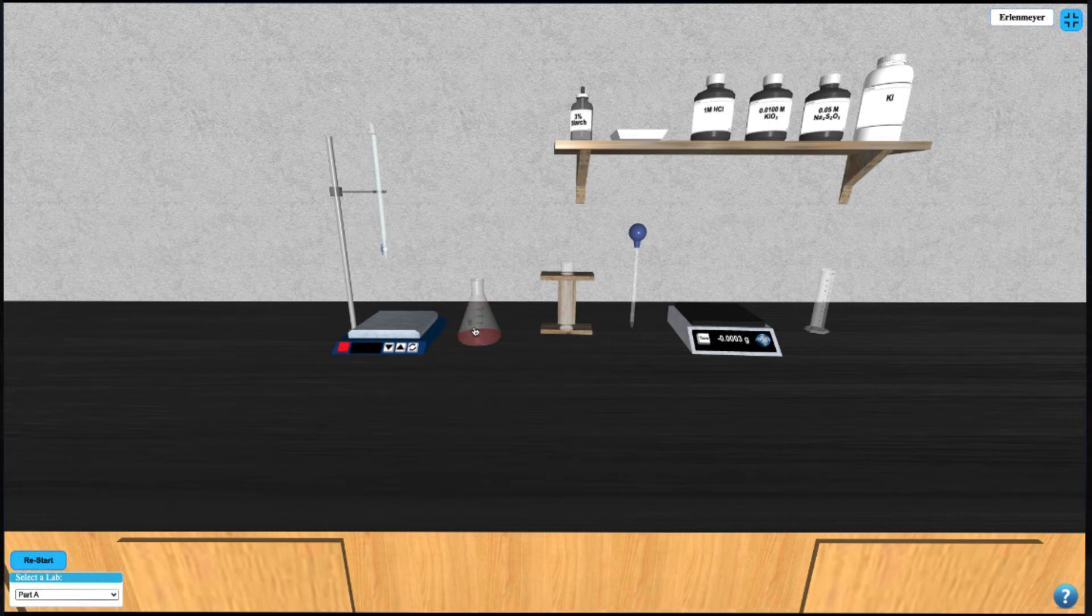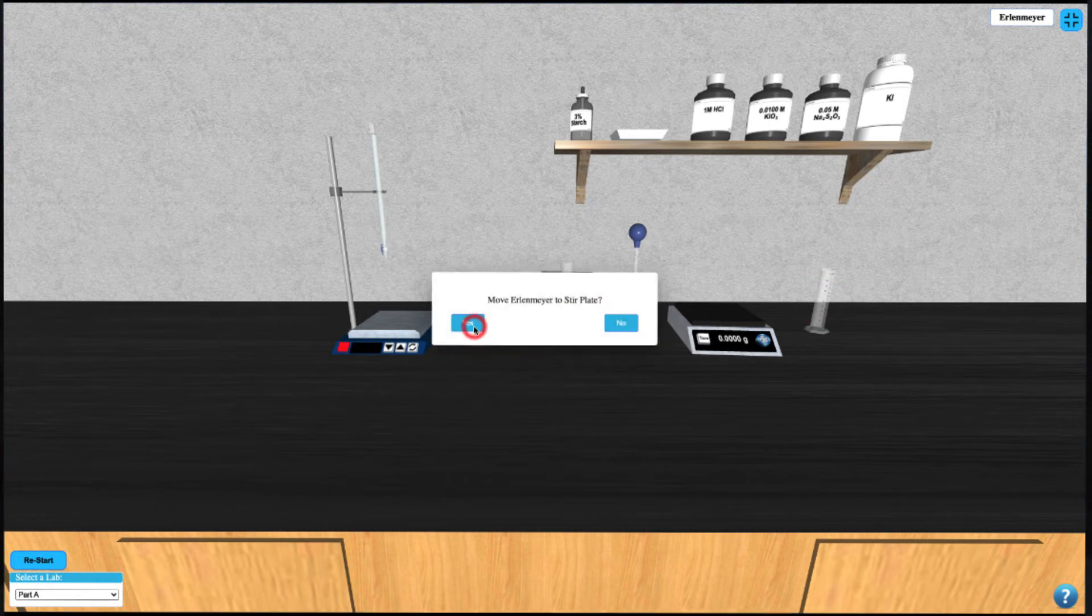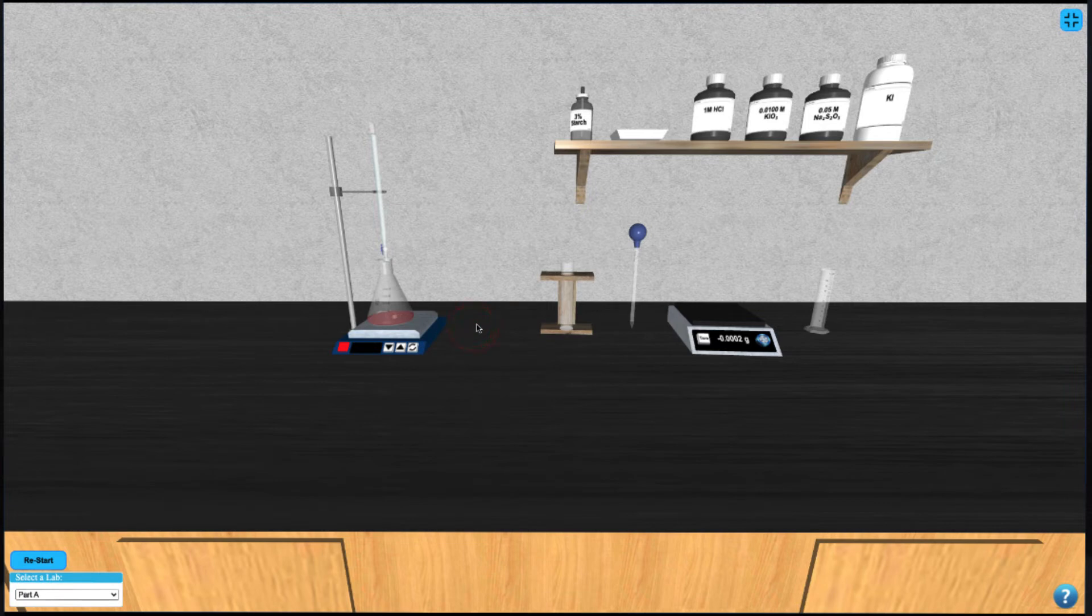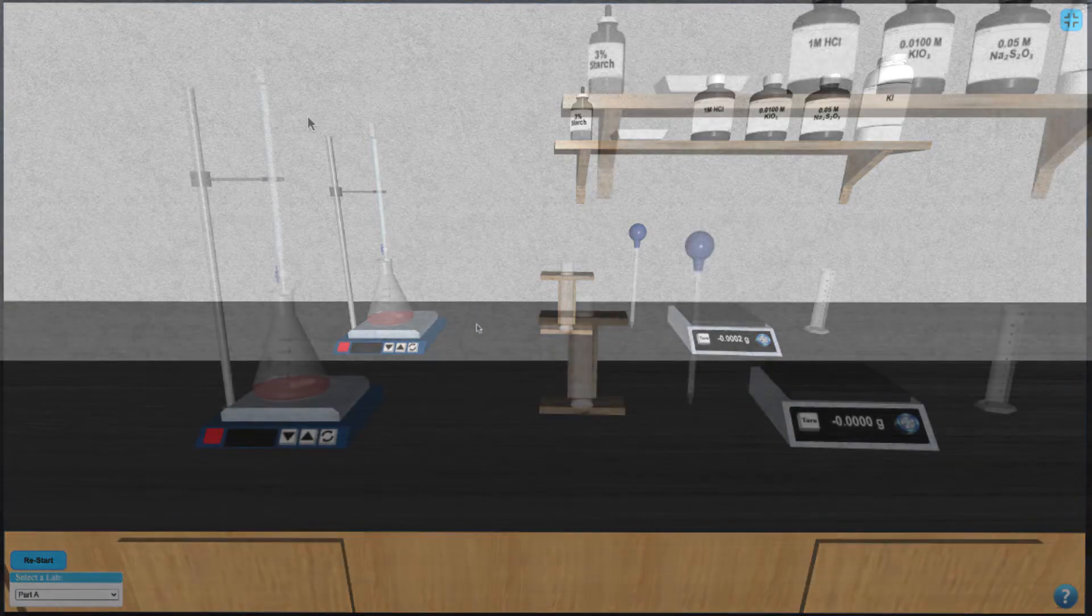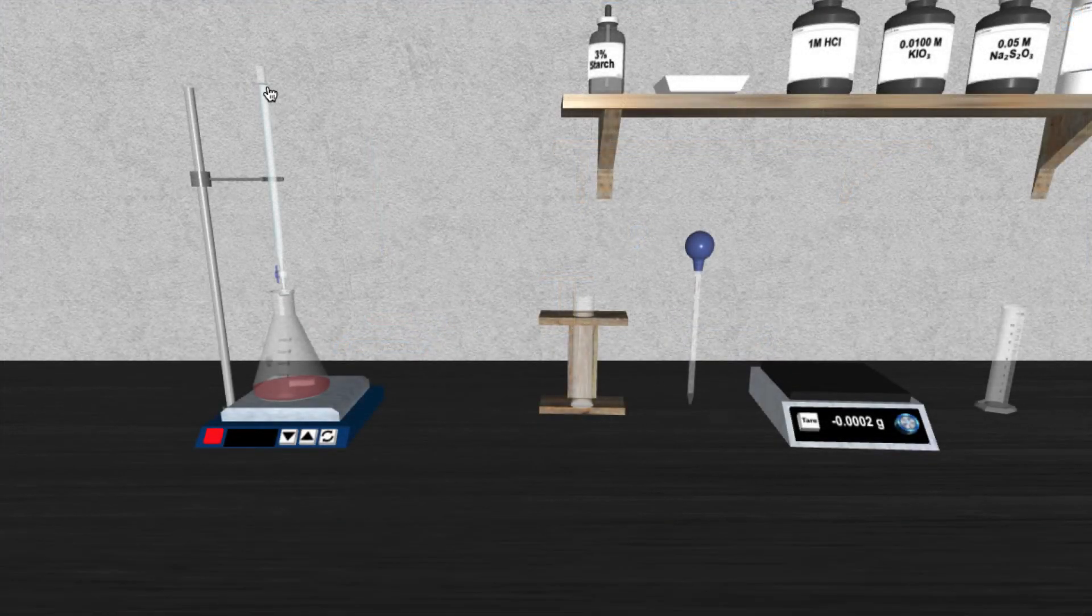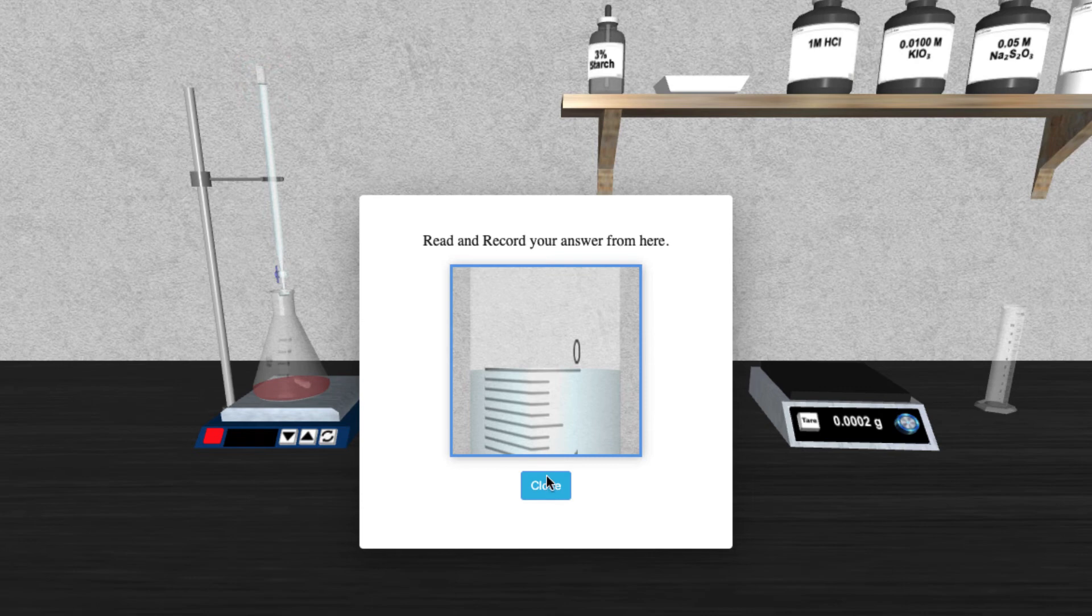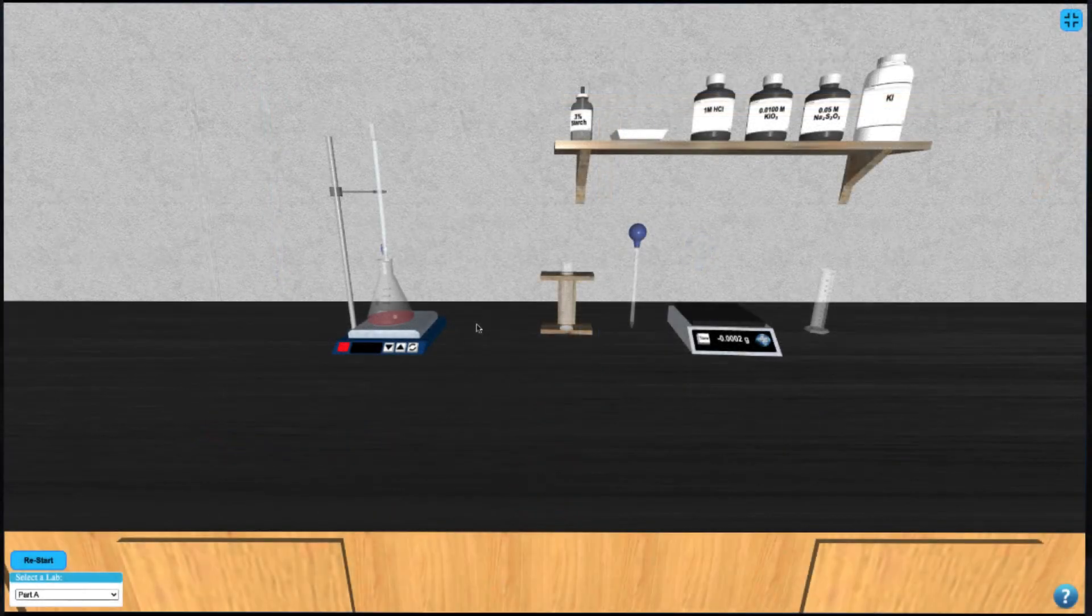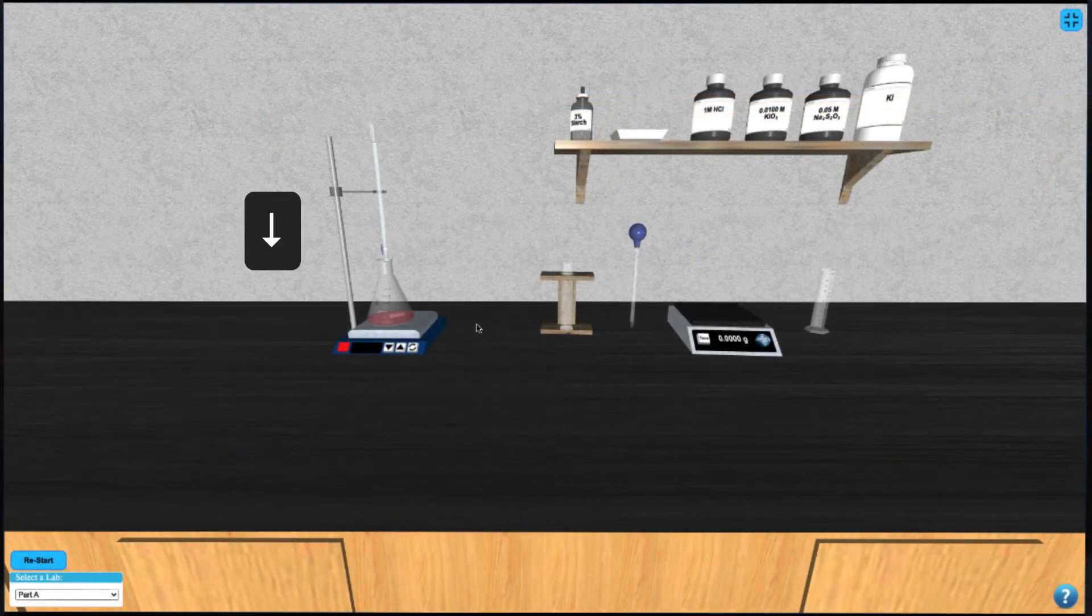Now we can begin the titration by clicking on the Erlenmeyer to move it under the burette. Be sure to make a note of the starting volume of the burette. Use the down arrow to titrate until required.